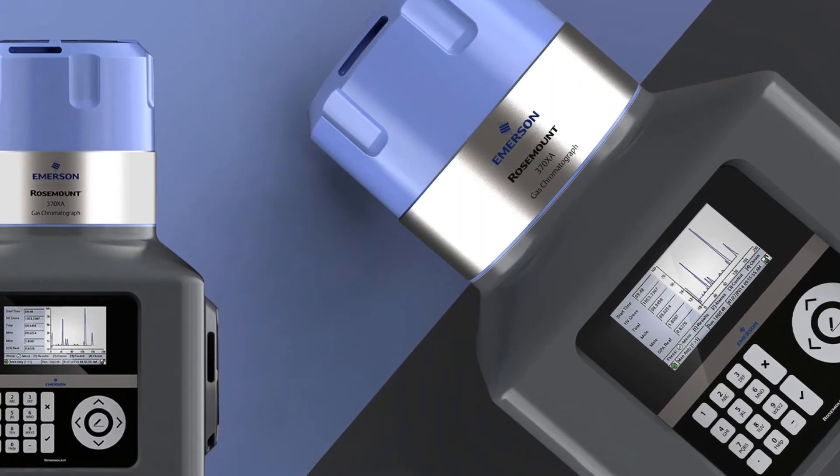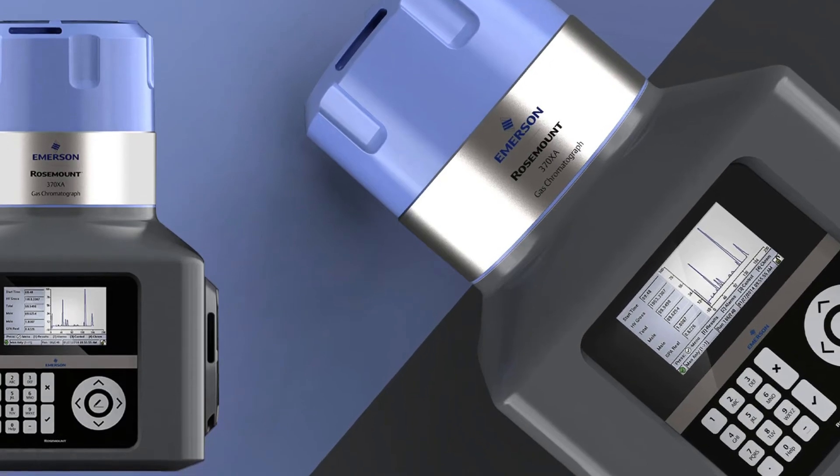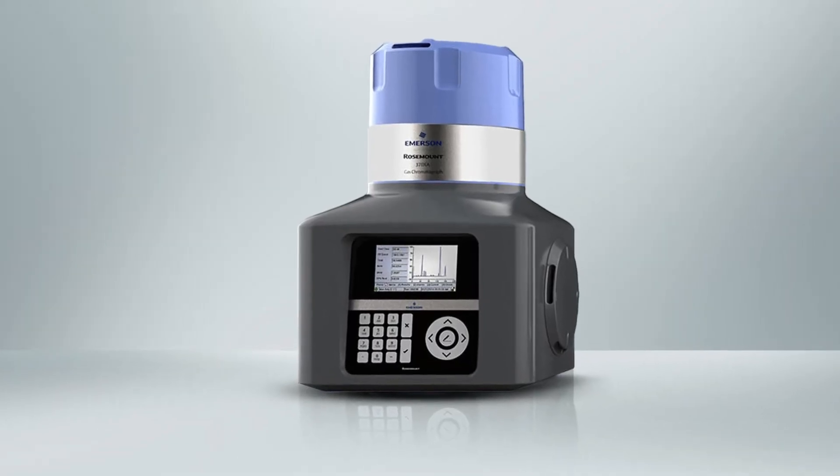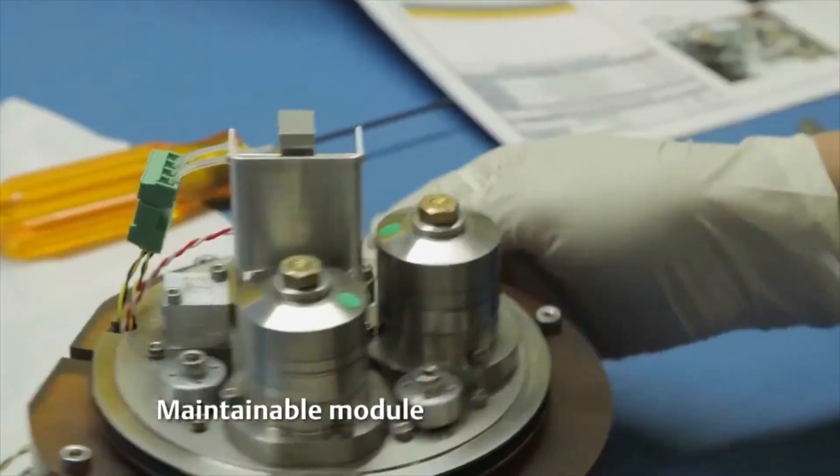The 370XA is Emerson's newest gas chromatograph designed for the custody metering of natural gas. The 370XA boasts a unique feature in gas chromatography, the maintainable module.